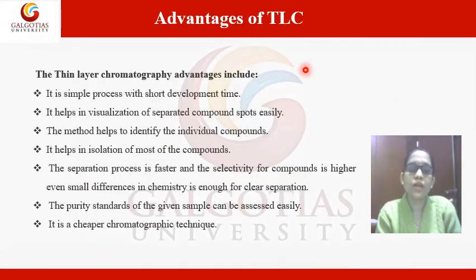Then what are the advantages of TLC? Thin layer chromatography has several advantages. It is a simple process with short development time. It helps in easy visualization of separated compounds or spots. This method helps to identify the individual compounds. It helps in isolation of most of the compounds.